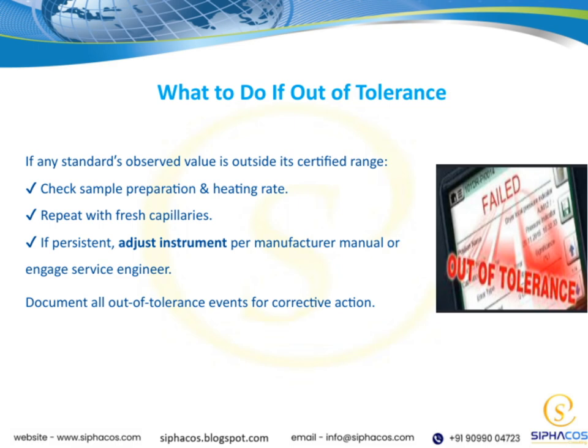And remember, always document any out-of-tolerance events you encounter. Keeping a record helps with troubleshooting and ensures that corrective actions are tracked properly. This process is crucial for maintaining accuracy and reliability in your testing.